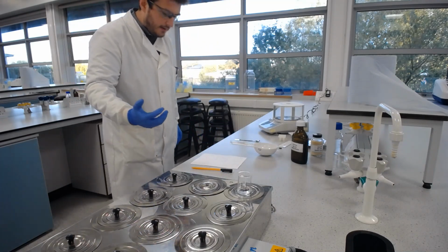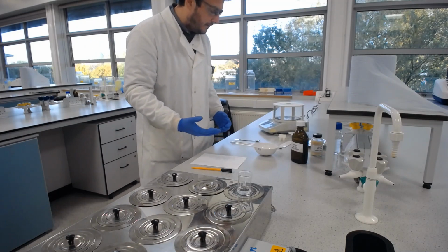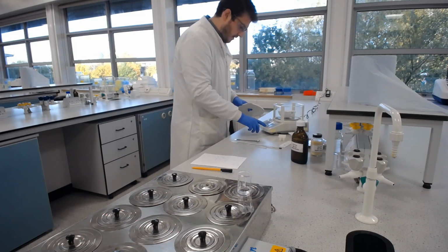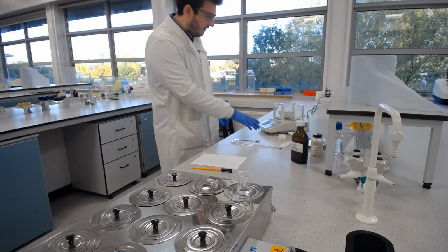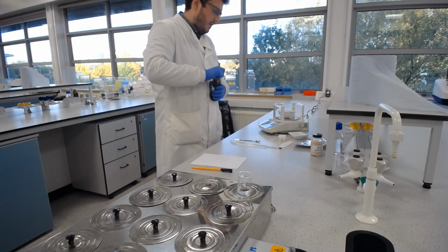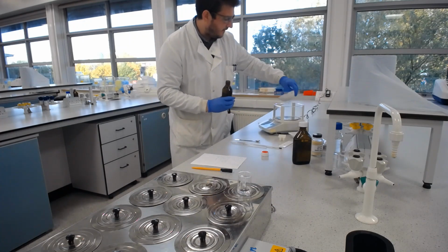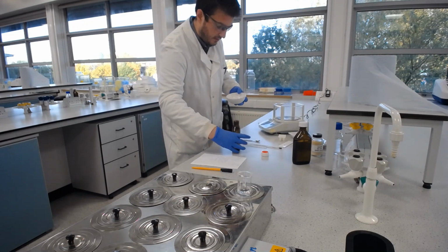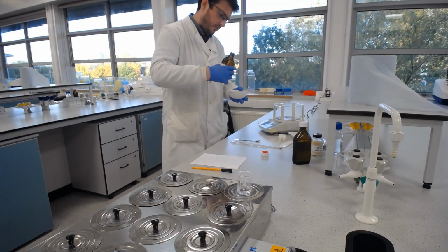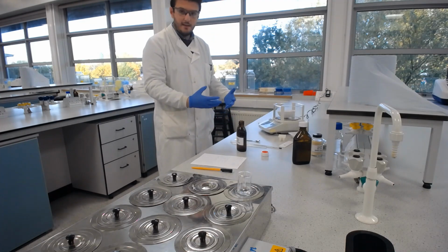We don't want all of that to evaporate away. So I'm going to weigh out 7 grams of glycerol and get that on the water bath as well. Now, you may want to do this into a weighing boat first, but I'm going to put that straight into the evaporating dish, 7 grams. And we're going to put around about 7 grams in there. So I don't know exactly how much 7 grams looks like. So I'll just take a cautious approach. Just put a small amount in and see how much that weighs. Incidentally, I tared this balance before I did that.